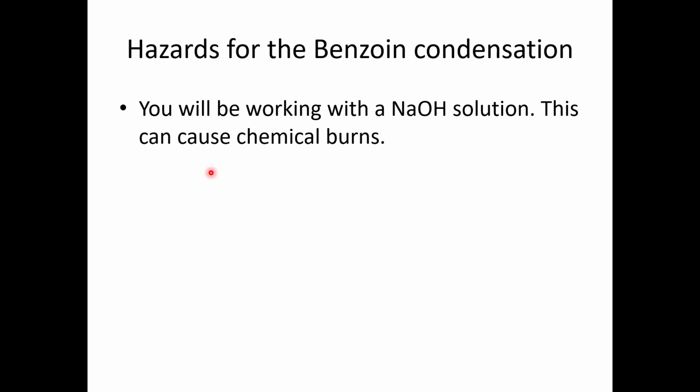In this case, you have already worked a lot with sodium hydroxide solution, so you know by this step that sodium hydroxide is a corrosive reagent and it can cause some burns on the skin. So you need to be careful. Always wear gloves when handling this reagent, and be careful not to spill it in the fume hood. If you do, you need to clean it very quickly. Otherwise, it can cause accidents to your partner or yourself.